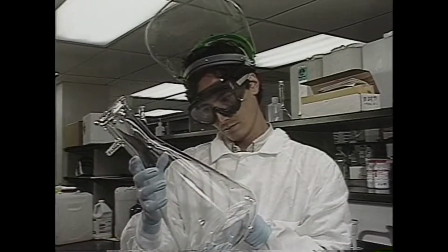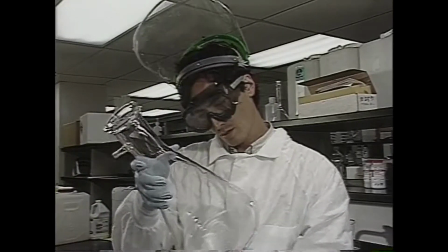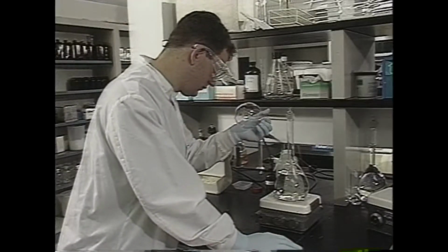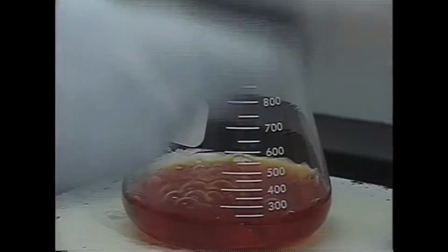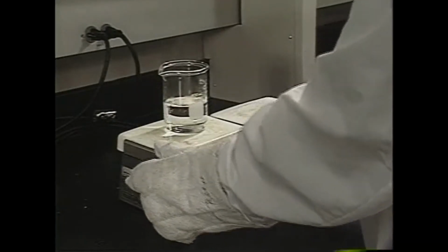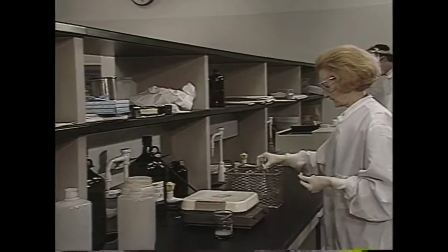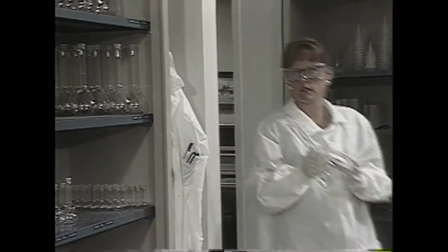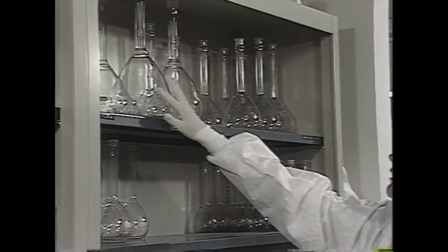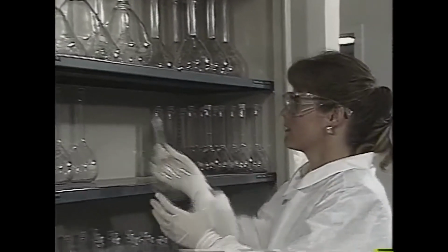Inspect glassware for cracks, chips, and other flaws before using it. Even a hairline crack can cause big problems, especially if you add heat. Heating glass causes it to expand, putting pressure on the flaw until it fractures. When handling heated glassware, remember to use insulated gloves. Forgetting this could cause things to get out of hand. Returning equipment to its proper place and keeping glassware away from the edge of shelves and countertops will also help prevent problems.